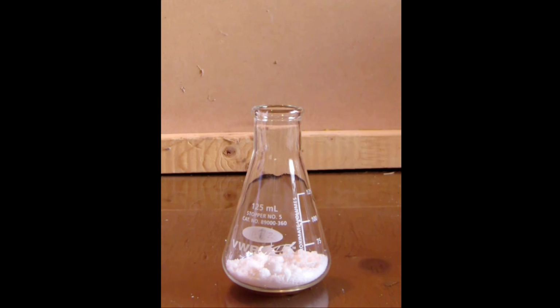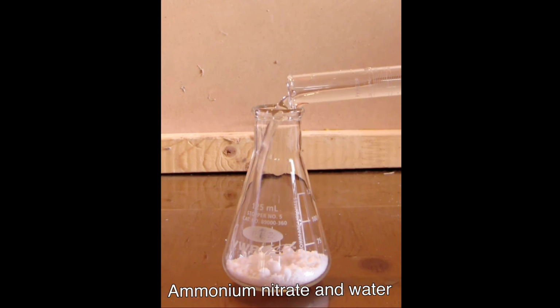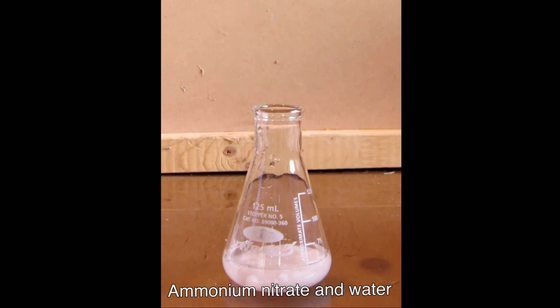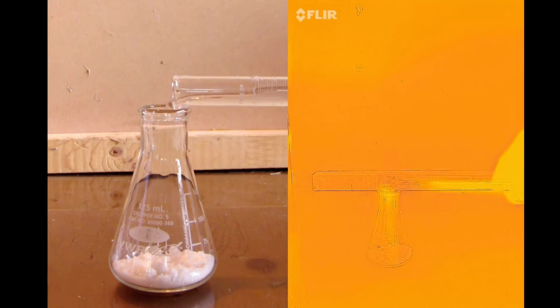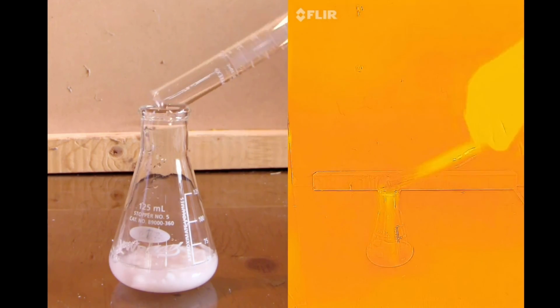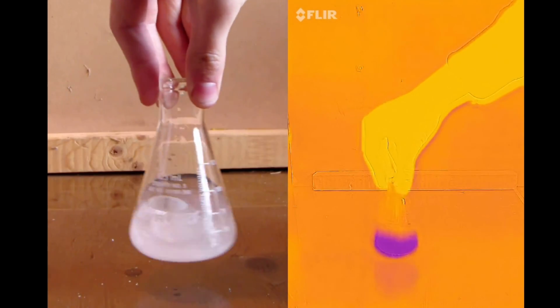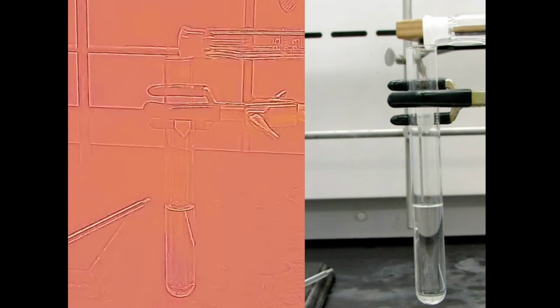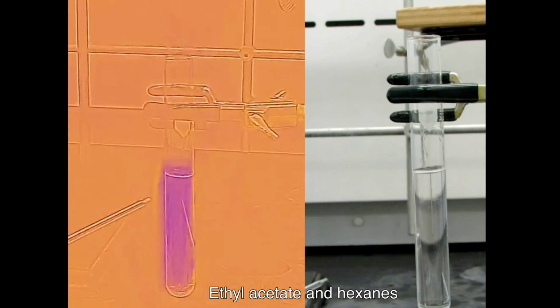Let's start with some endothermic reactions, which absorb heat from the environment as they occur. When ammonium nitrate dissolves in water, the solution becomes very cold, which is why ammonium nitrate is actually used in some instant cold packs. Looking at the reaction under IR, it is evident how quickly the solution temperature drops. Another slightly less endothermic reaction occurs when adding ethyl acetate to hexanes.